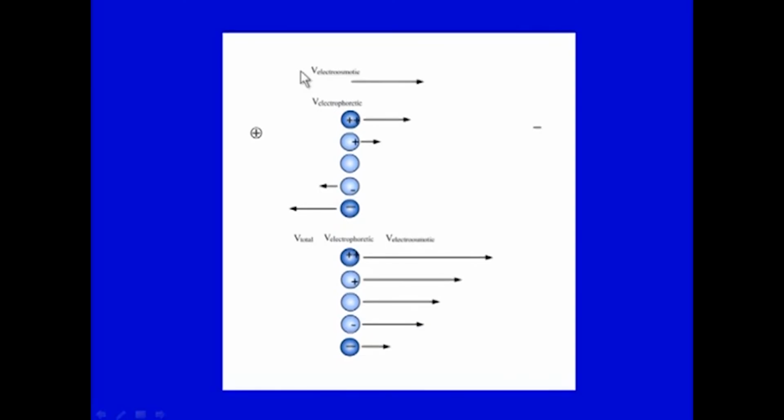Now, when you have electroosmotic flow, what is the movement of the charged species under this influence actually? If you see in this figure here, the velocity of electroosmotic flow, like how these charged species move, there is a comparison here. The more positive the charge, the more rapidly it will move towards the cathode; the less the charge, the less it will move.